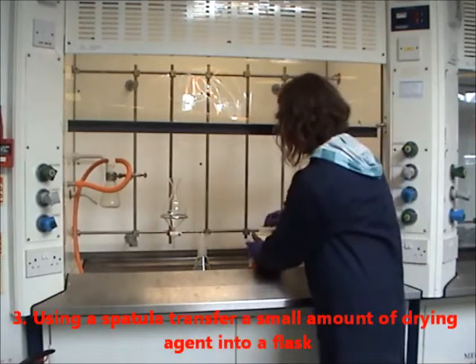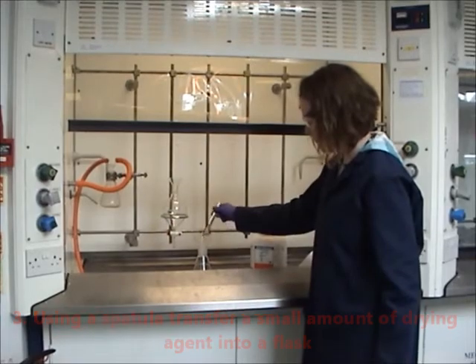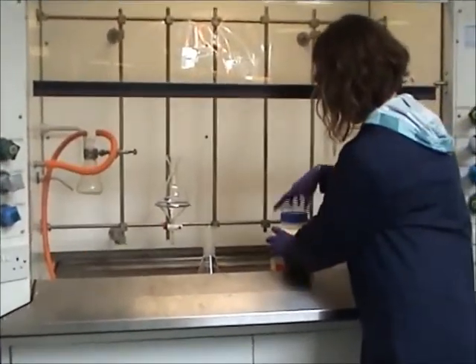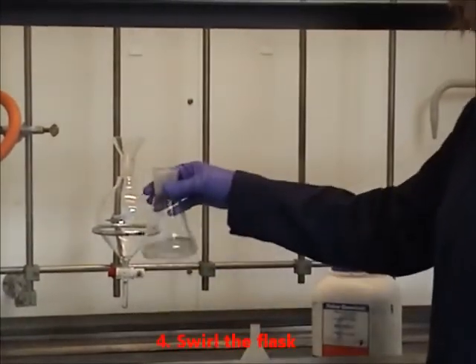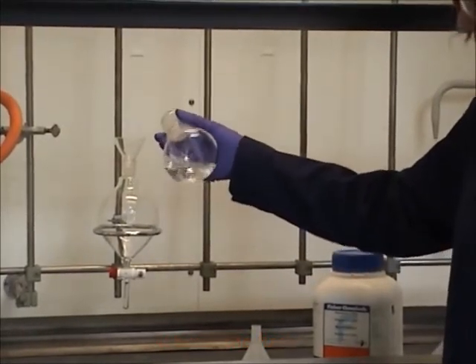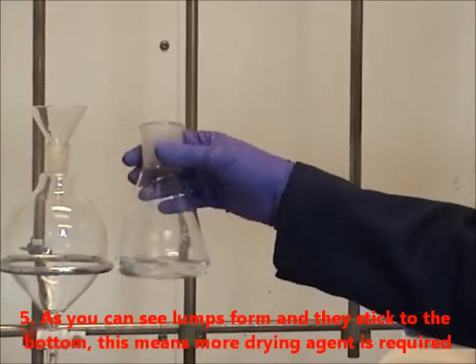Using a spatula, transfer a small amount of drying reagent into the flask. Swirl the flask. As you can see, clumps form and it sticks to the bottom. This means more drying reagent is required.